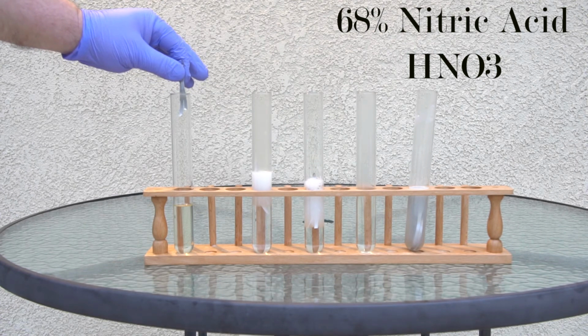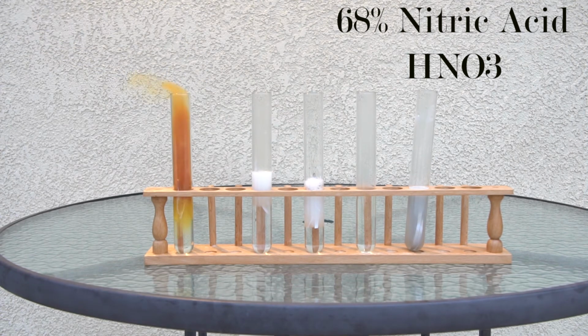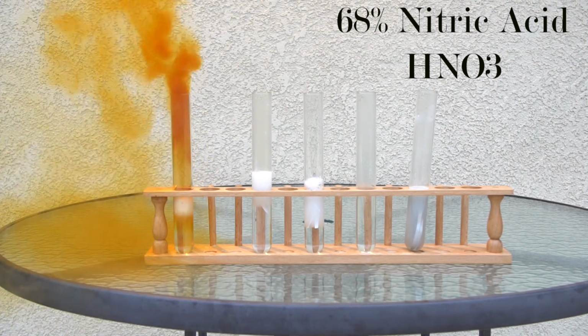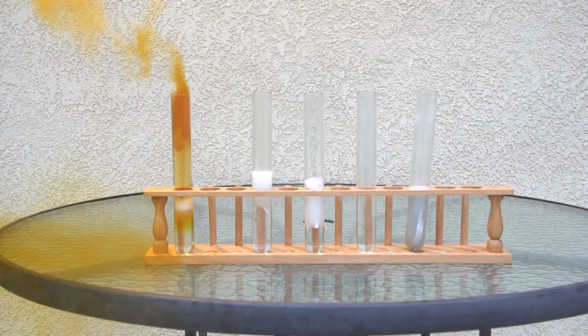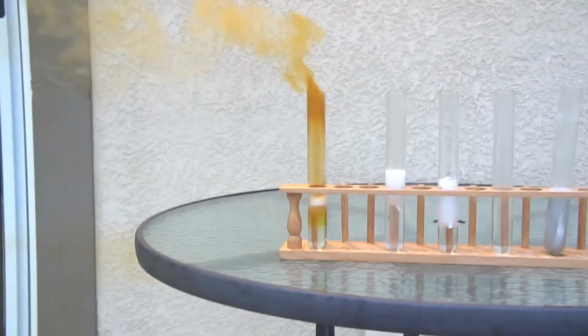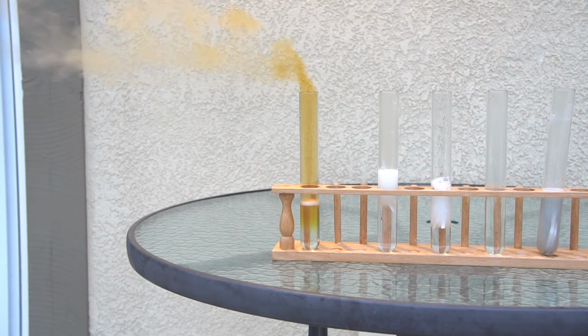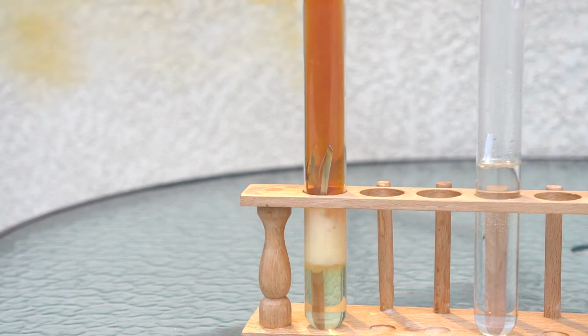So last but not least, concentrated nitric acid produced a very violent reaction, producing nitric oxide, NO, which instantaneously reacts with oxygen in the air, producing a brown nitrogen dioxide gas that you're seeing here. Nitrogen dioxide is a very toxic gas, and we had prepared for this scenario by moving far back. The good news is that the human nose can detect nitrogen dioxide levels much lower than when it starts to become dangerous. However, even though we moved very far away from this gas, we still caught a whiff of it. This should be an important lesson to anyone considering generating toxic gases, that even outside it is difficult to completely escape them.